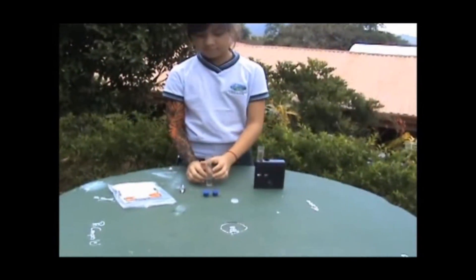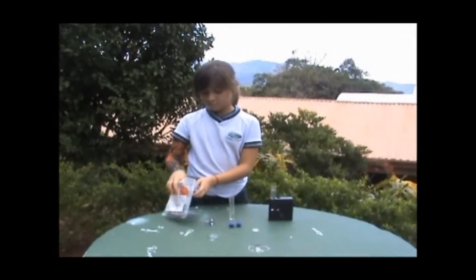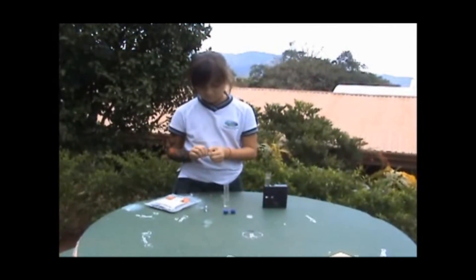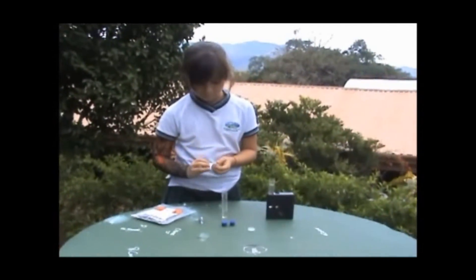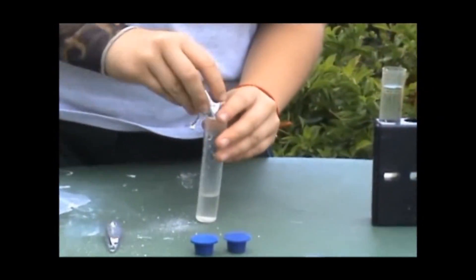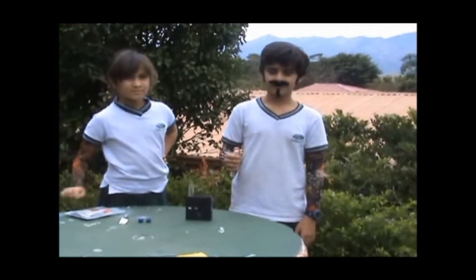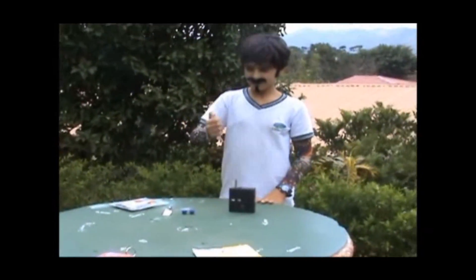Fill one tube to the bottom mark line with sample water. Fill another tube with water and place this tube in the outermost opening of the black box. Add the contents of one NitraVer 6 nitrates reagent pack. Cap the tubes and shake for 3 minutes, then allow the tubes to stand undisturbed for 30 seconds.